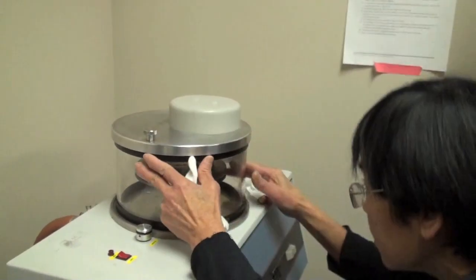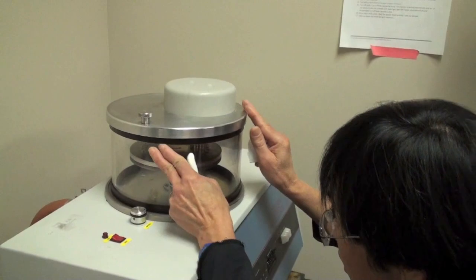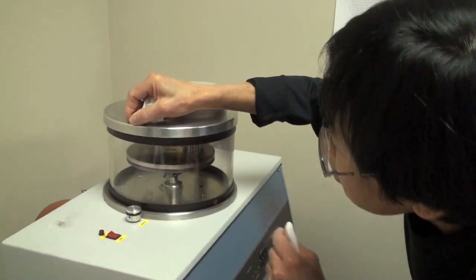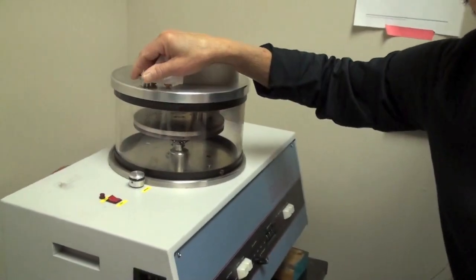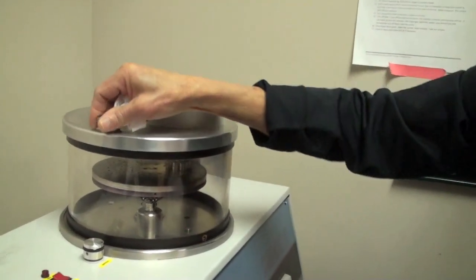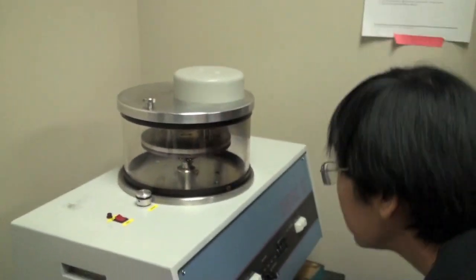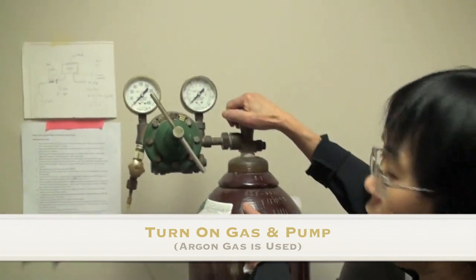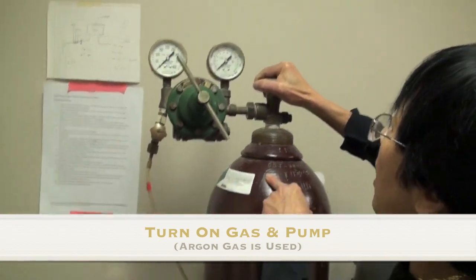When you close it, make sure that it's underneath, because sometimes when they close it, it goes like this. You're not going to get the vacuum, because you have to make sure that it's fall down. So you turn on the argon. Argon gas.